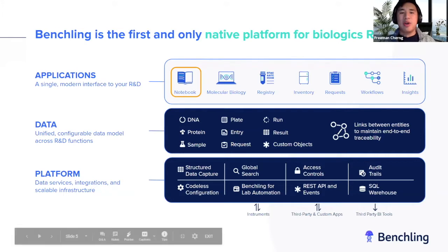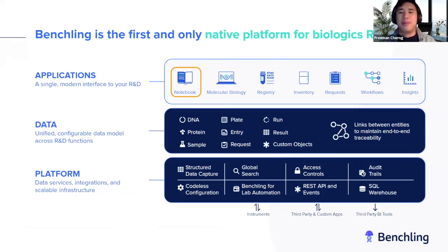So back to the notebook, we think of it as a central source of truth on the Benchling platform, meaning that it can encapsulate all parts of your research workflow, from observational notes to experimental protocols. As we get into the more advanced features in our second session following this, you'll find that it can sync with the other applications in Benchling with structured tables such as registration or transfer tables.